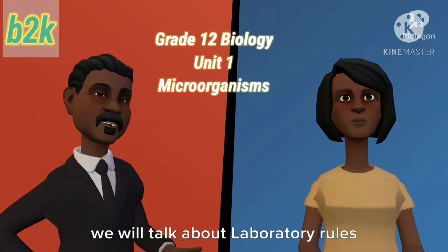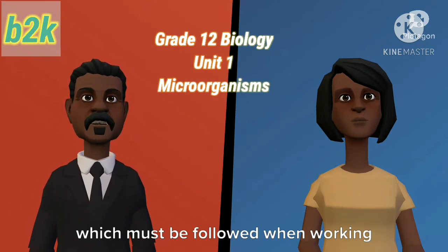In this video we will talk about laboratory rules which must be followed when working with microbes.